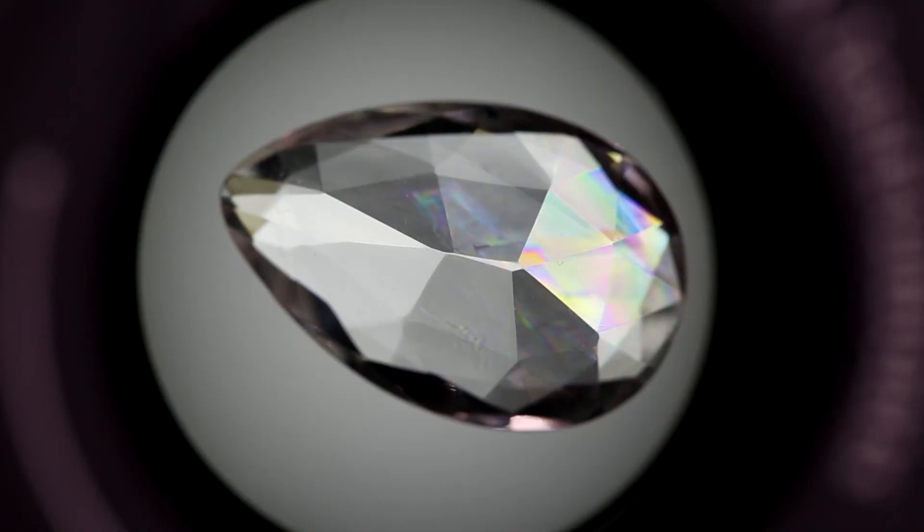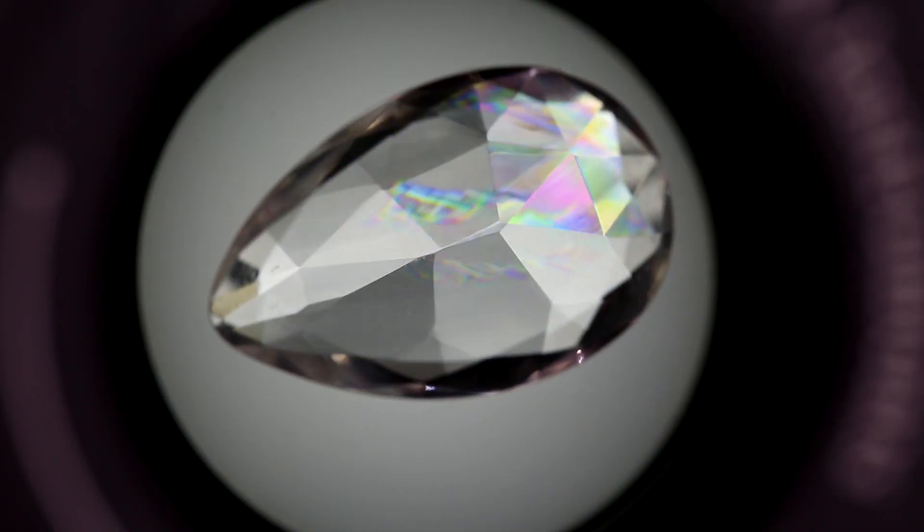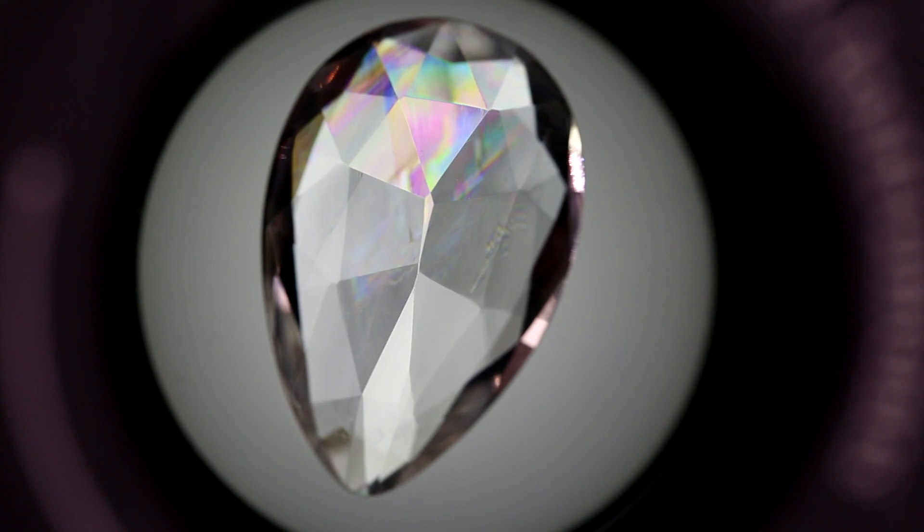If iridescence is seen when looking through the polariscope, this indicates that you are looking along the optic axis of a doubly refractive gem. To be sure that this is the case, and that you're not viewing iridescence in a fracture or other inclusion, turn the gem on a different axis and test again to see the light and dark patterns.